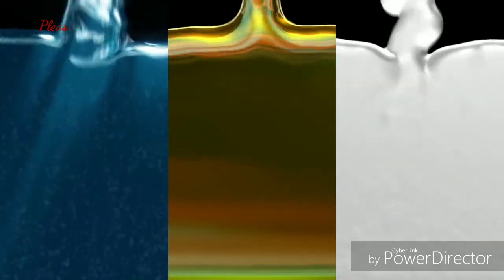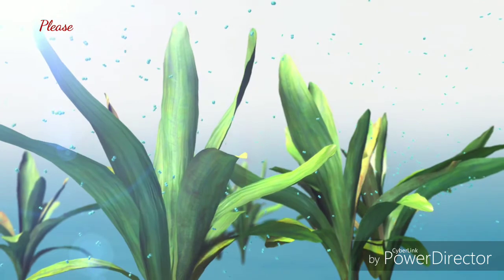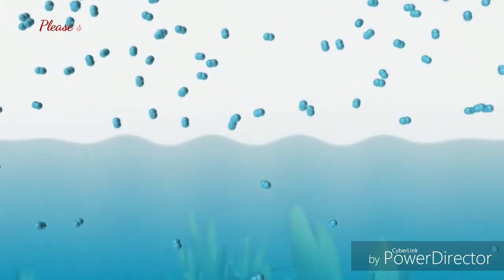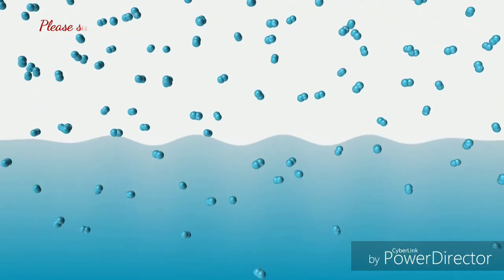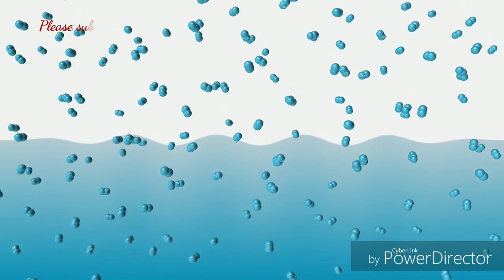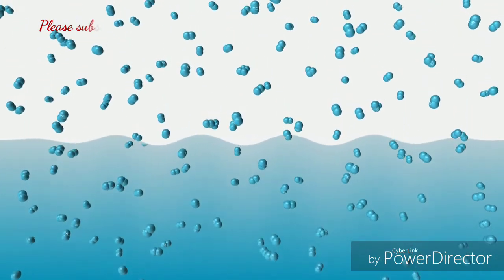One of these principles is the measurement of dissolved oxygen in liquids. Oxygen penetrates liquids in different ways, for example via oxygen-producing plants, waves, or gas exchange with the atmosphere. At the water surface, oxygen molecules migrate from the atmosphere into water and vice versa. Once the oxygen is in the water, it distributes evenly to achieve a uniform distribution in space.